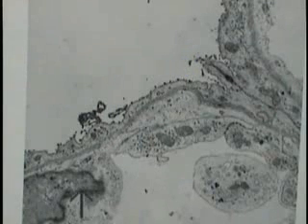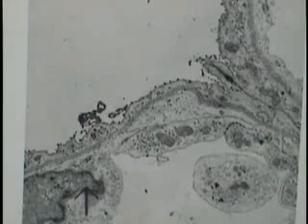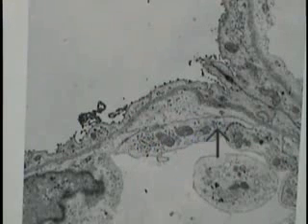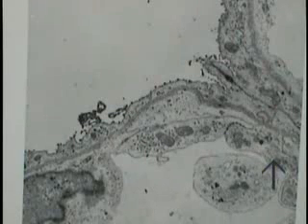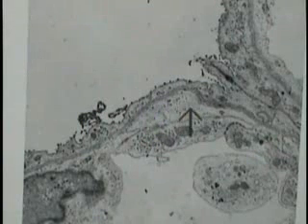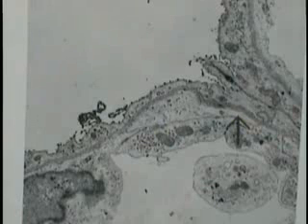This region here is an endothelial cell nucleus. It has a junction here with another portion of an endothelial cell that extends from here to here, and then another endothelial cell goes off in this direction. Or I guess it's going up here and it's sort of overlying. We have a little bit of overlapping of these particular endothelial cells.